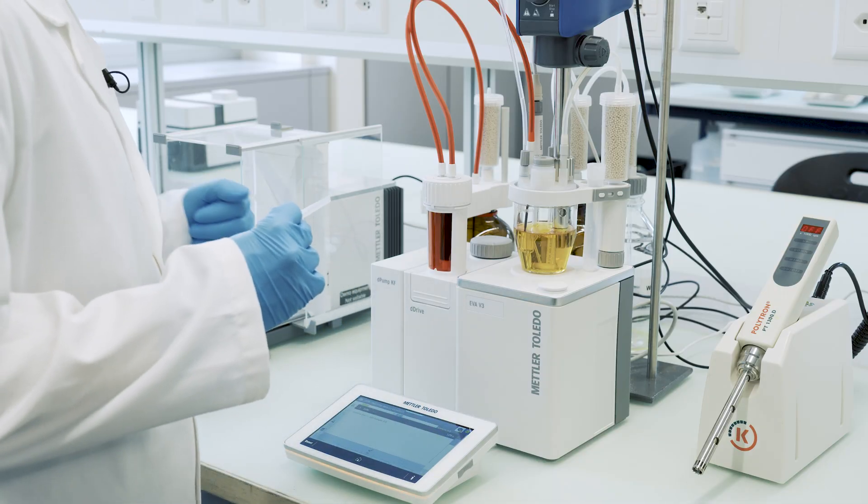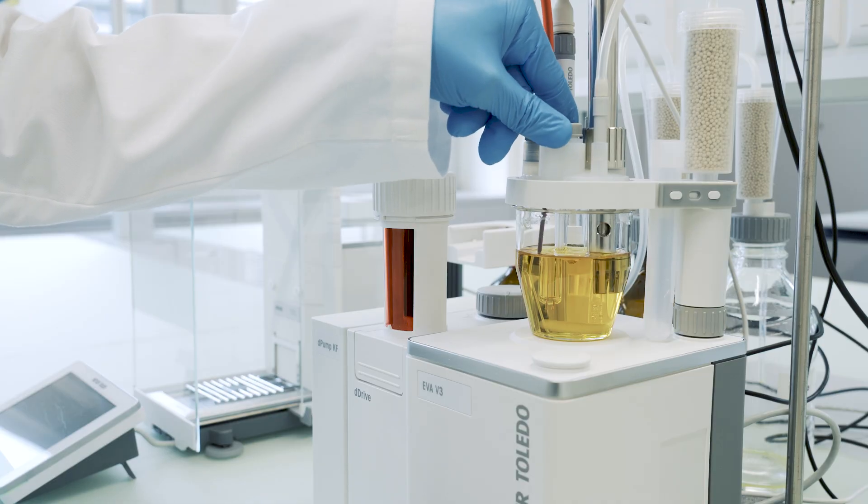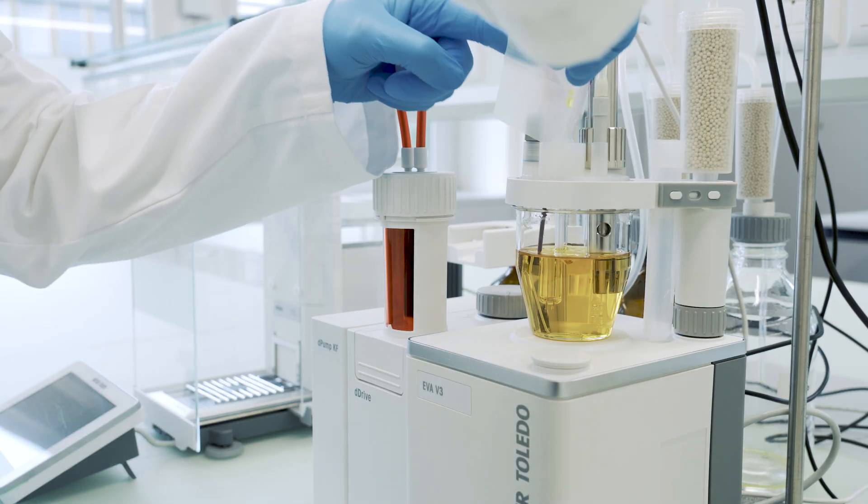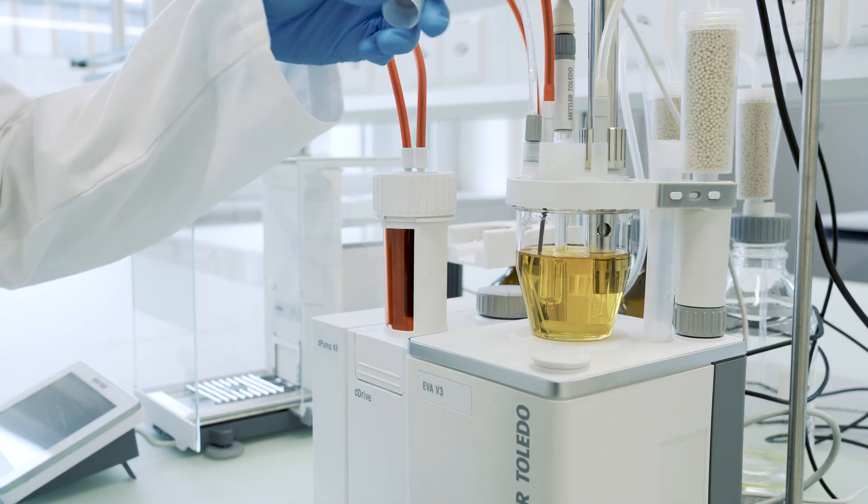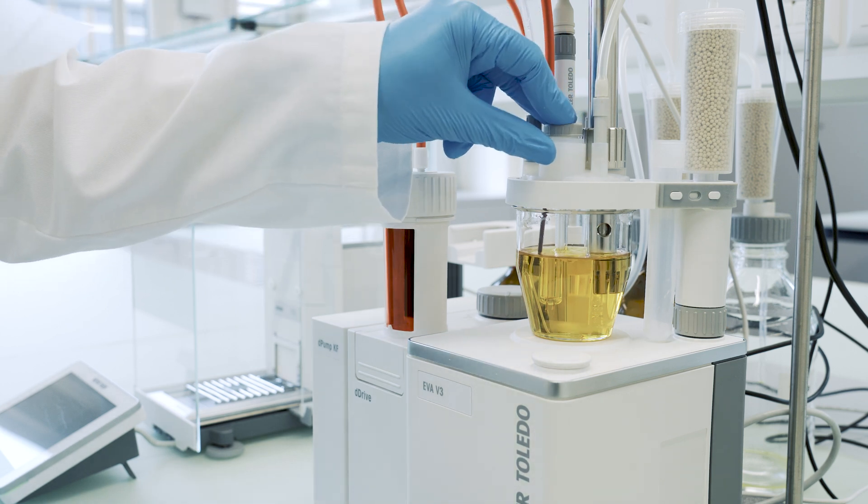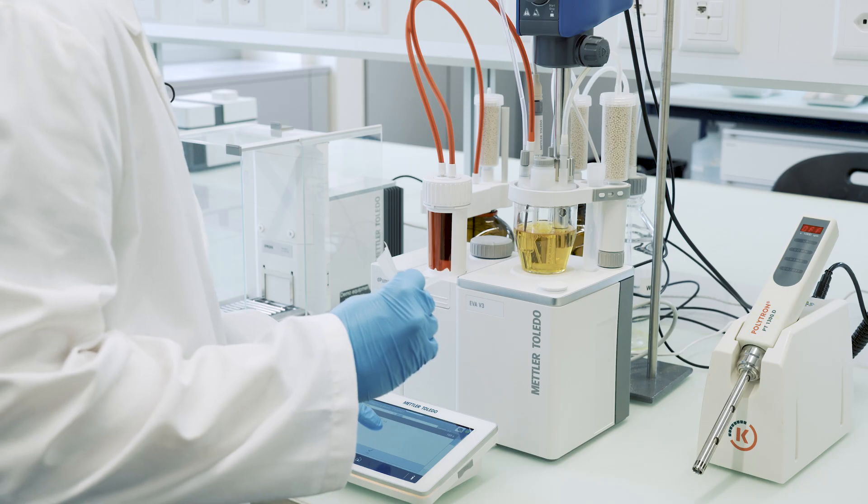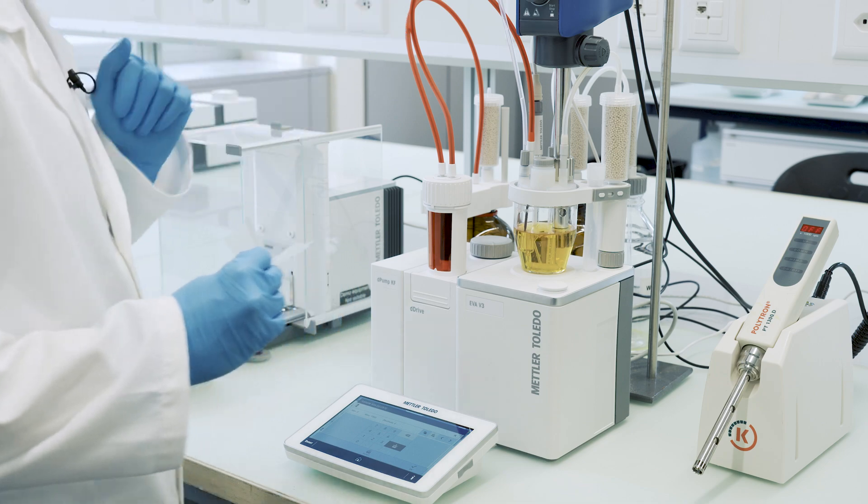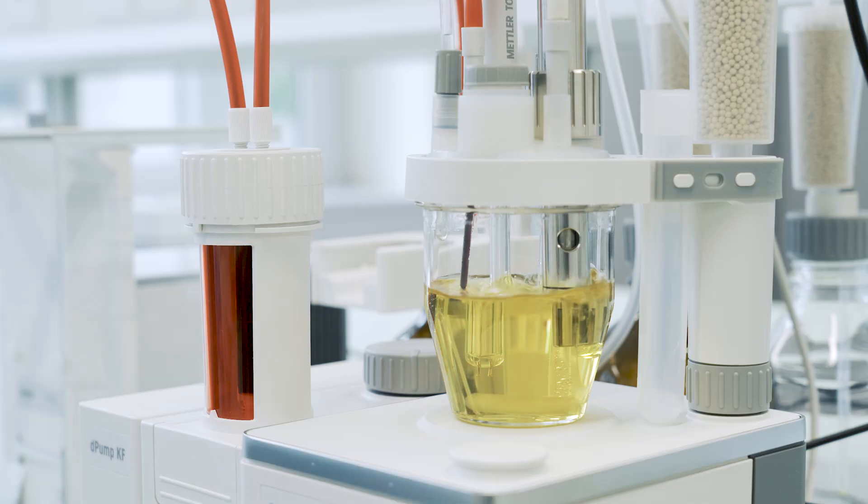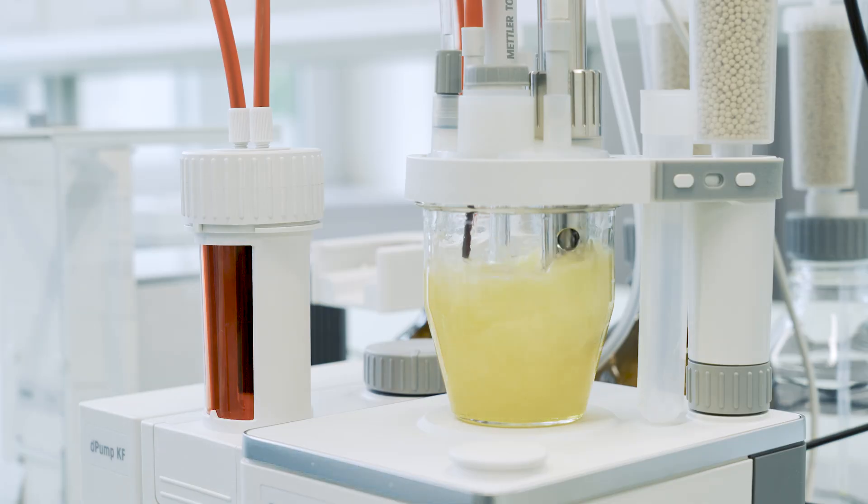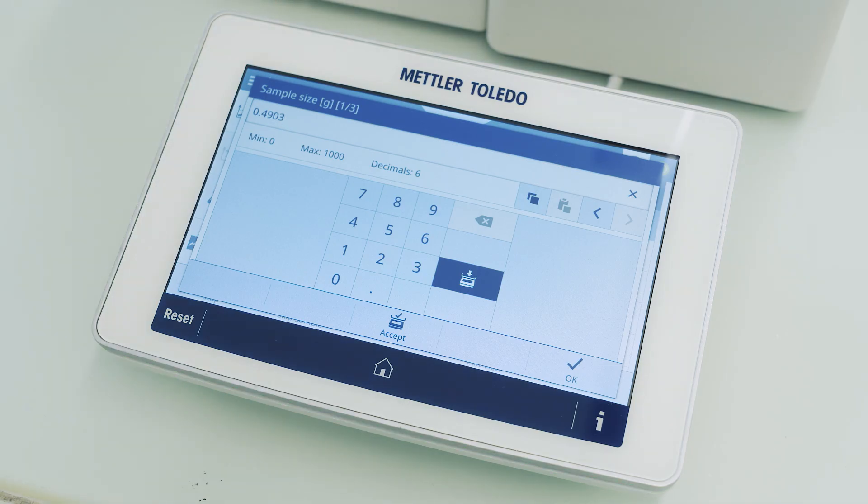Now we're being asked to add it. I'll remove the stopcock, add the piece of gummy bear, and once I accept it the homogenizer will start. The sample weight is determined with the back weighing technique and is automatically transferred from the balance to the titrator.